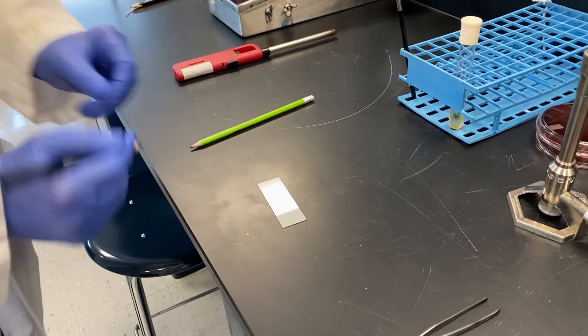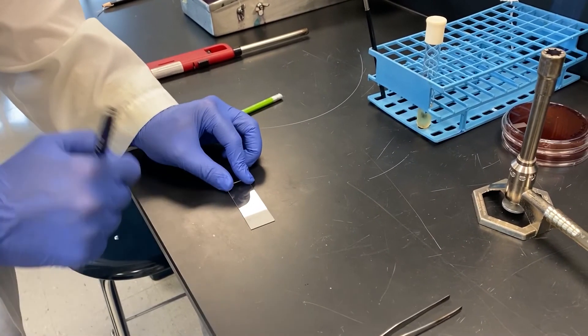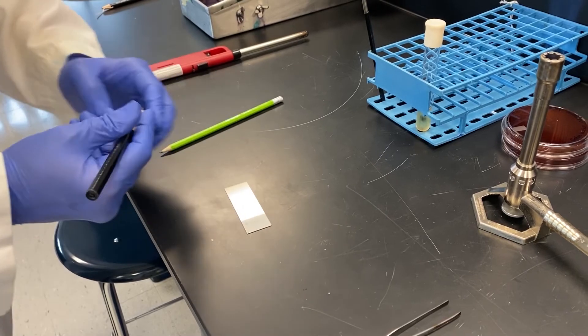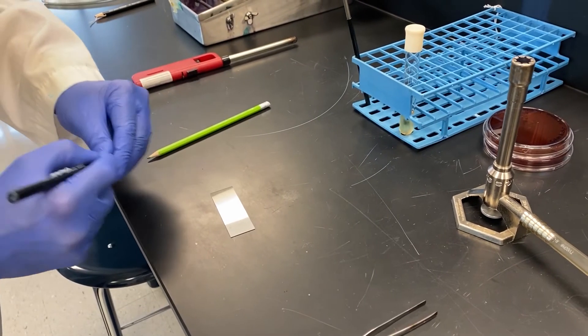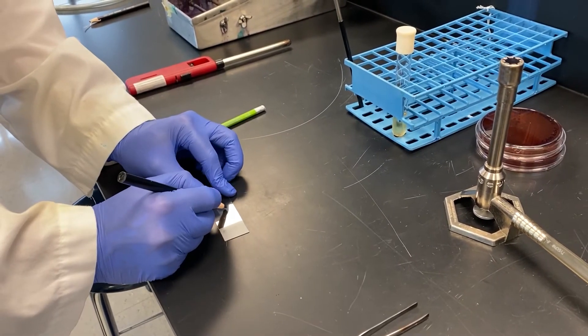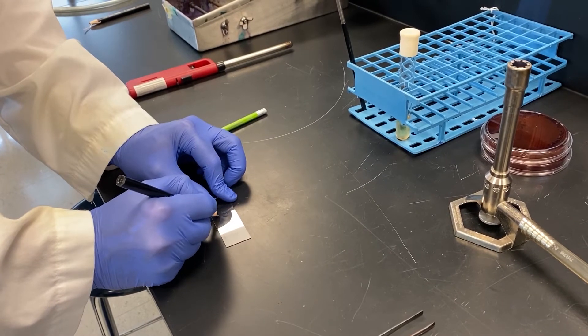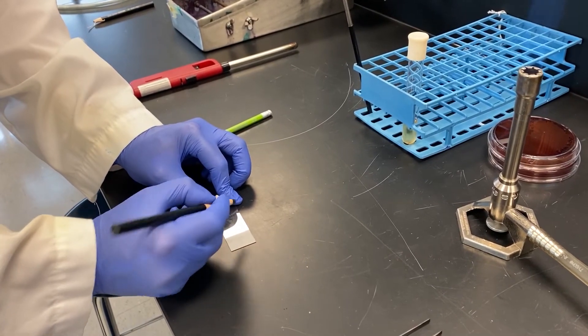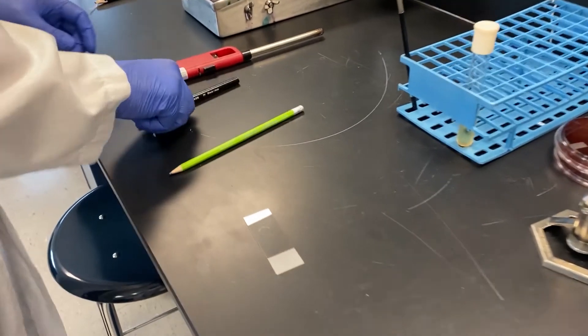When preparing a smear from a broth culture it's easy to lose your culture on the slide. It helps if you use a wax pencil and draw a circle around where you will actually place your culture. This will help you when you go to look at your culture under the microscope.